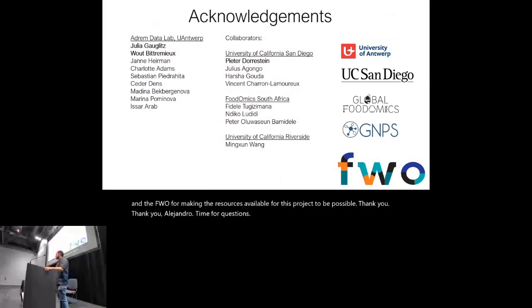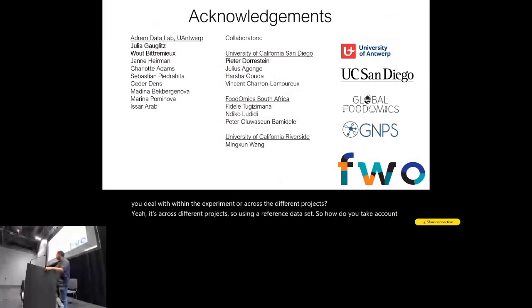Thanks for the talk. I'm very curious about the technical side of your clustering algorithm. Do you deal with it within the experiment or across the different projects? Yeah, it's across different projects, so using a reference dataset. So how do you take into account different instrumentation, resolution? Yeah, it's all those metadata. We don't specifically.